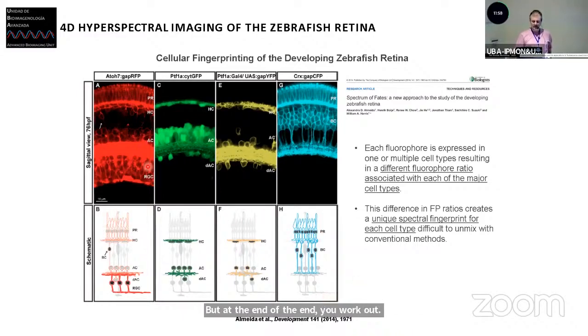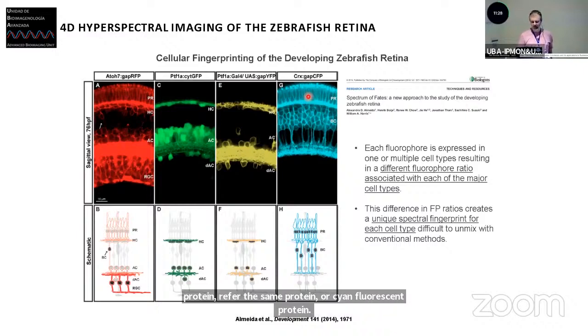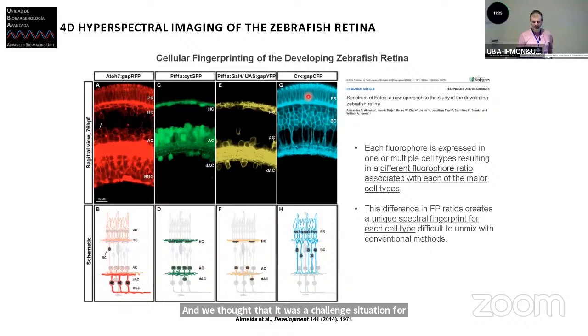So we used this model of zebrafish. You can study the retina because you have labels for different parts. Depending on which kind of cells they are, they will express different fluorophores, and this fluorophore can be red fluorescent protein, green fluorescent protein, or cyan fluorescent protein. We thought that this was a challenging situation for this new approach using the sine cosine filter.